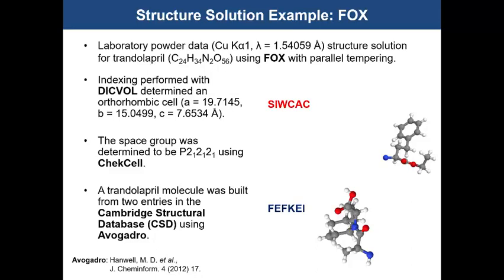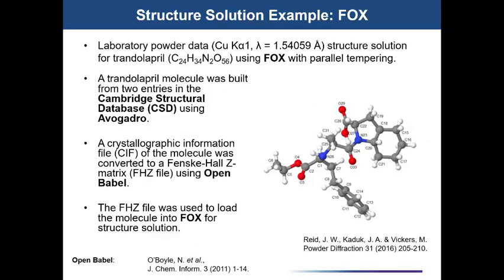And then I used a chemical editor called Avogadro. This is freeware. And I basically imported both of these fragments into one Avogadro session. And then I manually manipulated them around to attach them by the nitrogen atoms here and here to create a single molecule that looks something like that.